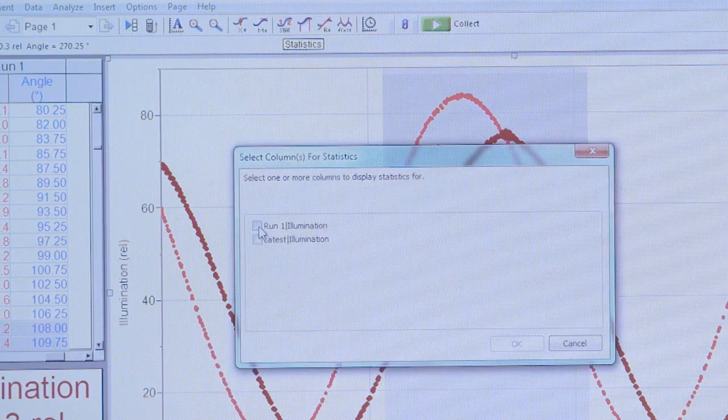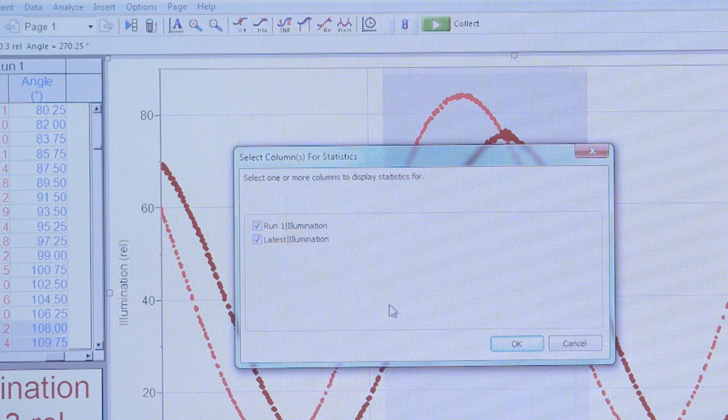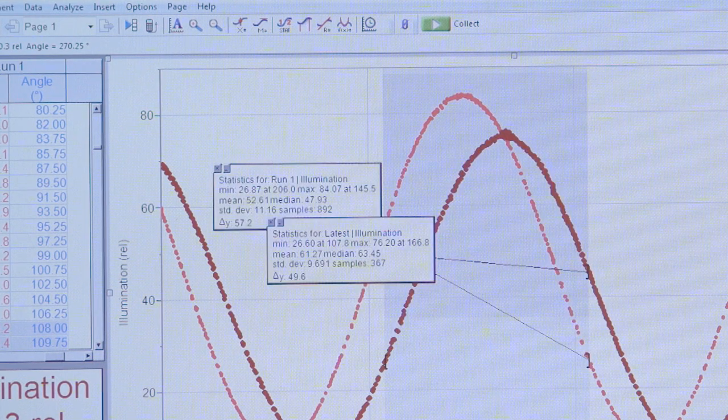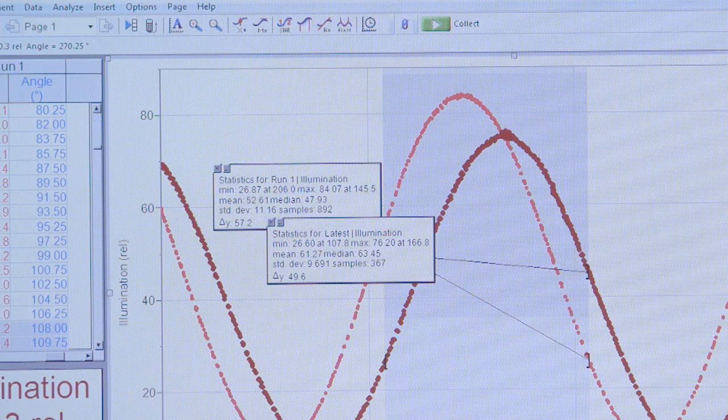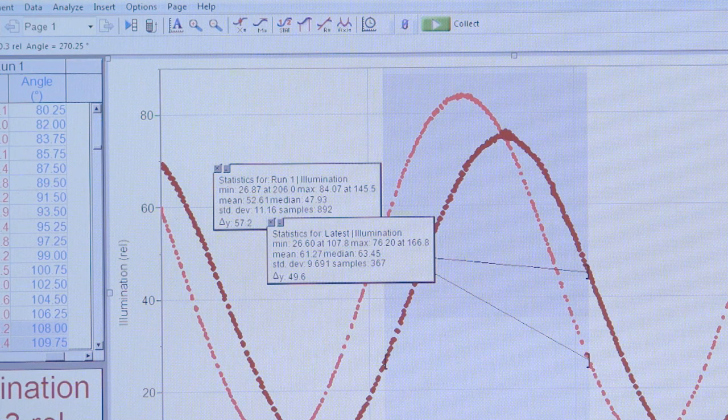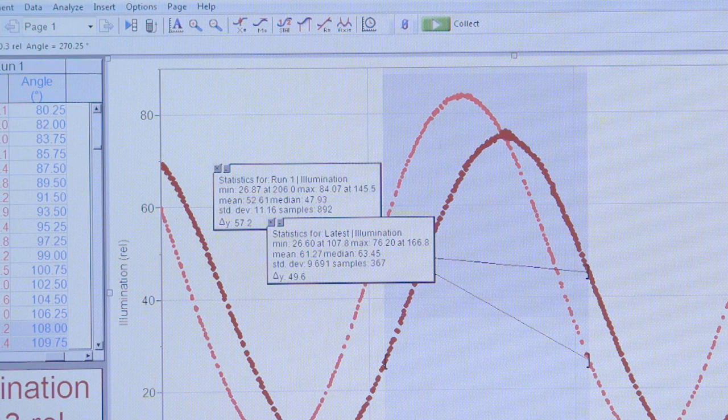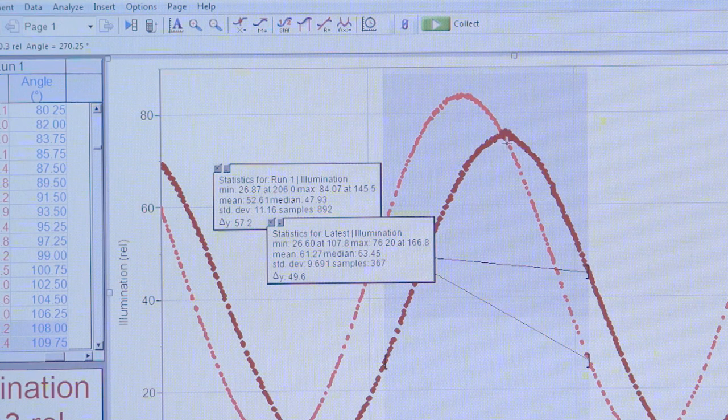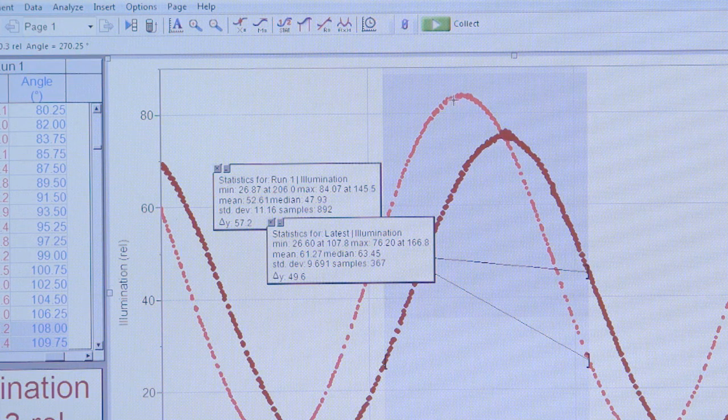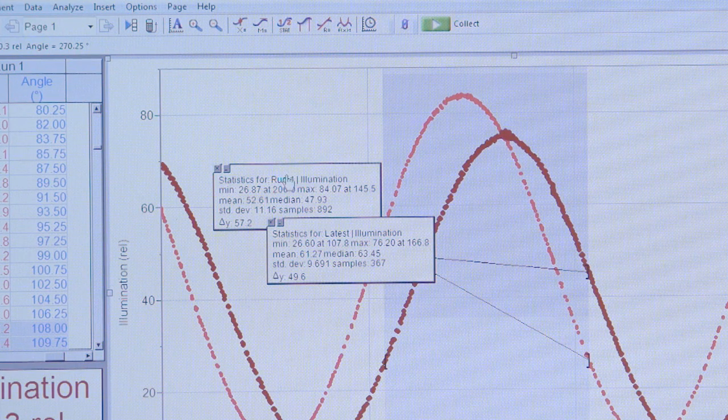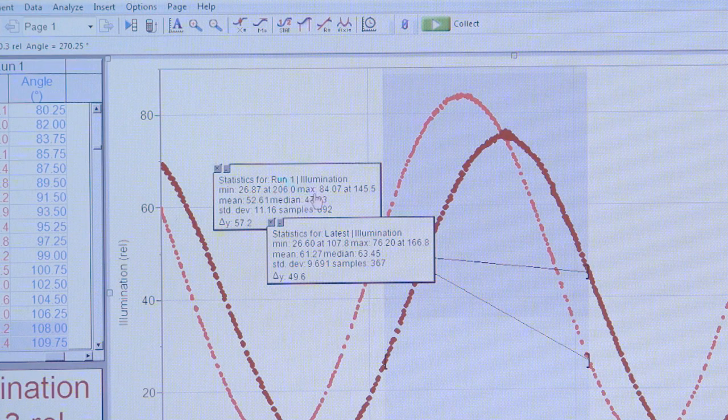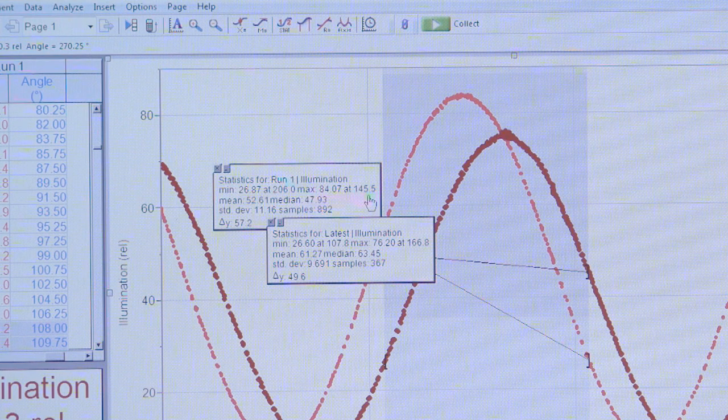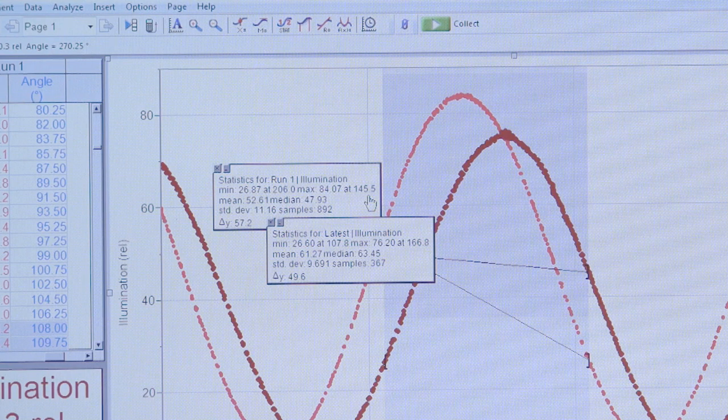I want to analyze both the blank and the sample at the same time. Select okay. The value that I care about when I'm trying to figure out the optical rotation is the angle at maximum illumination, the absolute peak of this wave. Statistics gives you that value with the maximum y at x. This is the value of the angle at maximum illumination.